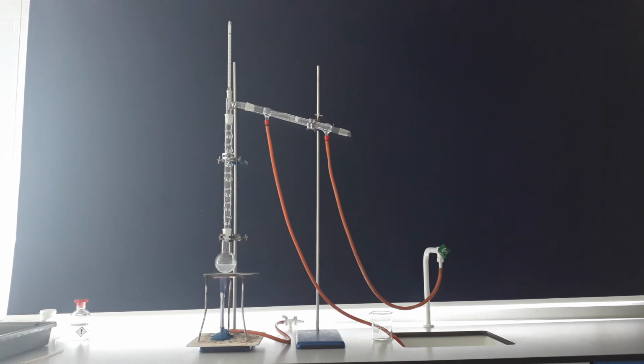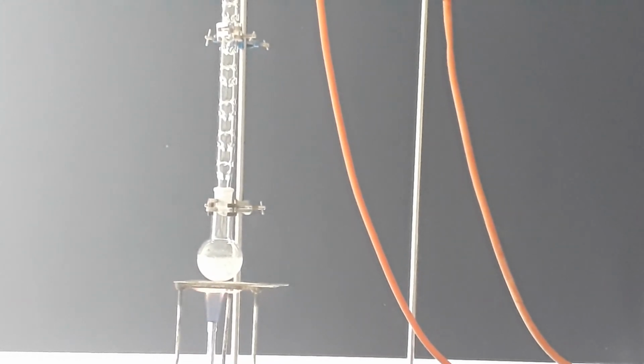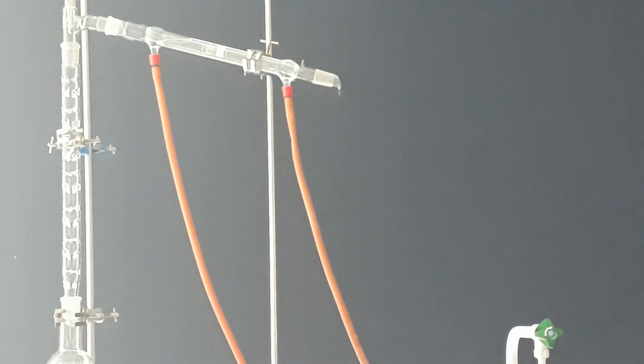If we wished it to separate more, what we would have is a range of condensers coming off of the side that would collect the substances at different boiling points. As you can see here, the liquid is now boiling and the substances have started to evaporate up the fractionating column. And now you can see the ethanol dripping out of the end of the condenser. We are collecting this in a beaker ready to test.